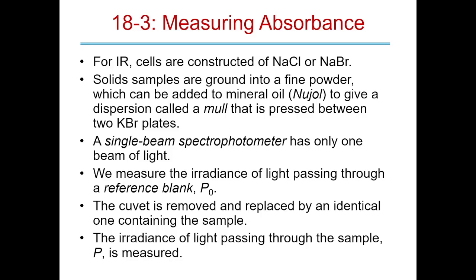Okay. By the way, if you ever take a background, that overall concave-looking structure that you see in a background for IR, that's actually your salt. That's your windows. Okay? And where it's going down is where it's absorbing a lot, so you get a much worse signal there. So your limits of detection are much worse there. Okay? Your dynamic response is also much worse.